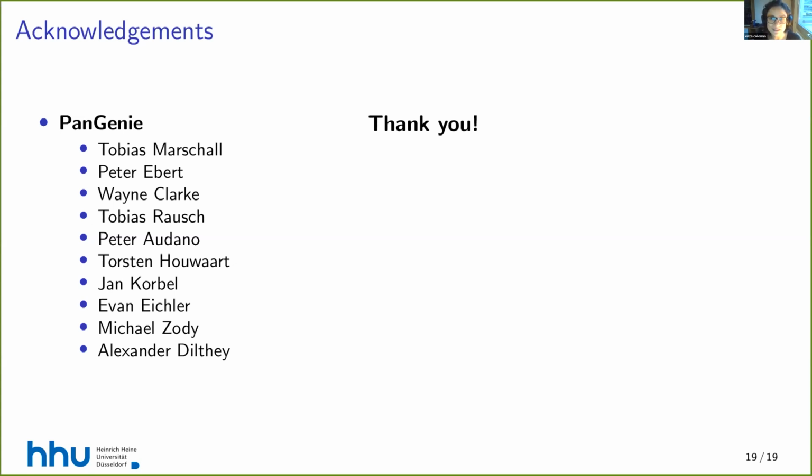Anyway, so let's go to the second question. Maybe I missed it: how did you compare the VCFs? Have you used hap.py? If not, how did you manage comparison of complex variation, if any? So for the comparison, the easy thing was that most of the tools are actually re-genotyping the variants, so I gave the same VCF as an input and all of the tools would predict the genotype for the exact same variant. So the representation doesn't change. And then comparing it was relatively easy because we could just match to the corresponding ground truth genotype.